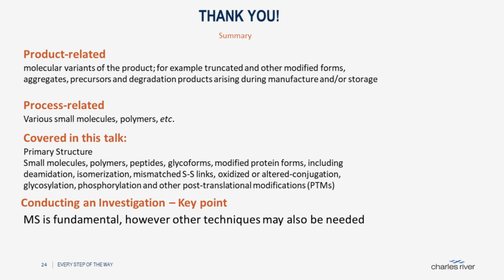Okay. And how accurate is the MAM to quantify deamidation, as it may be due to sample preparation at pH around 7 to 8 for the sake of trypsin? Yeah, and that's definitely one of the challenges with developing an MAM method, is that significant effort has to be put into method development upfront.